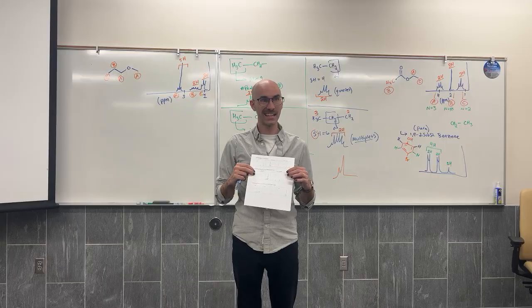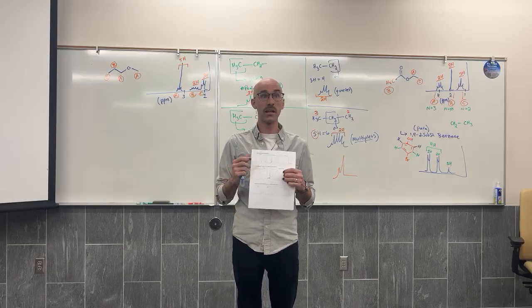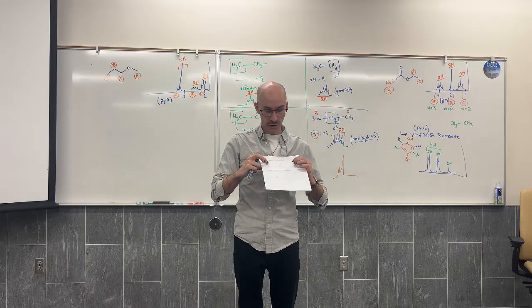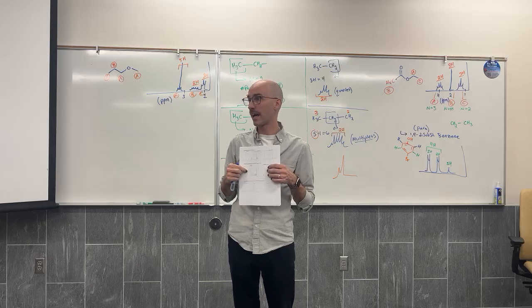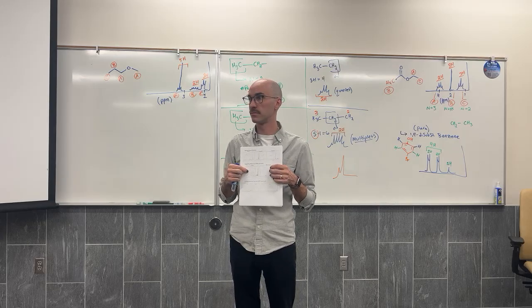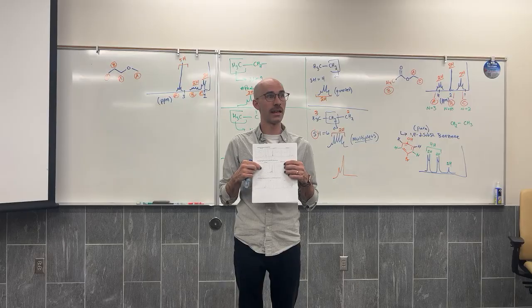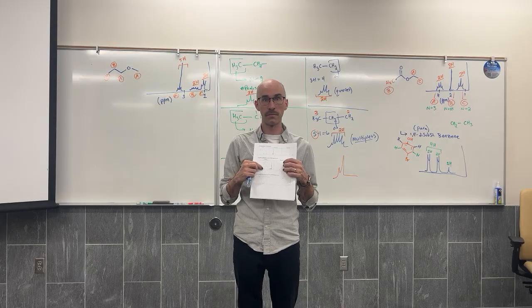So when assigning cholesterol, you might not be able to assign every single peak, but you could assign specific peaks. For instance, cholesterol has 1 vinylic hydrogen. Do you see the 1 hydrogen bonded to the alkene carbon? It's on the bottom.